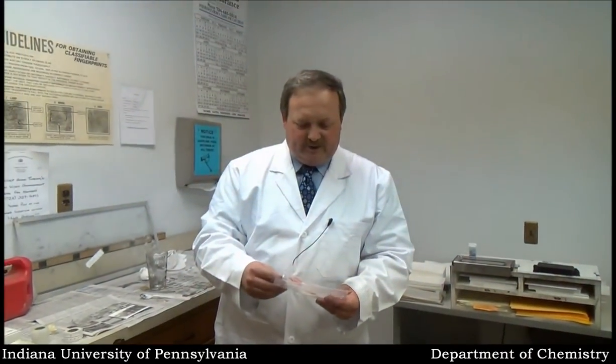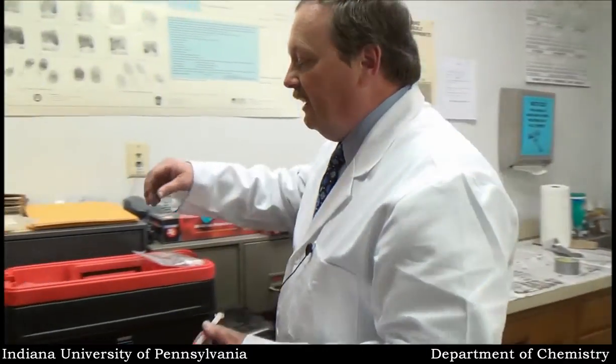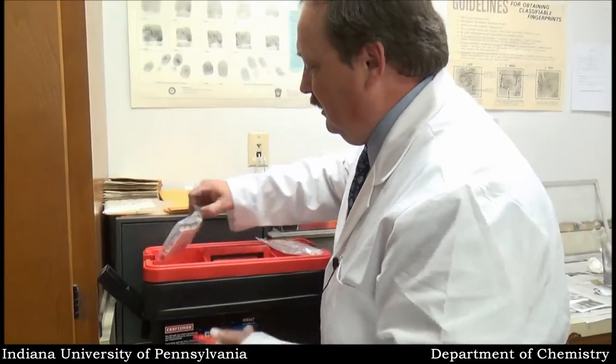Another technique for developing latent fingerprints is through the use of iodine. We have a couple of methods that we can use. I'm going to try one and show you the other as a demonstration. We have these ampules here that are essentially iodine fuming wands.